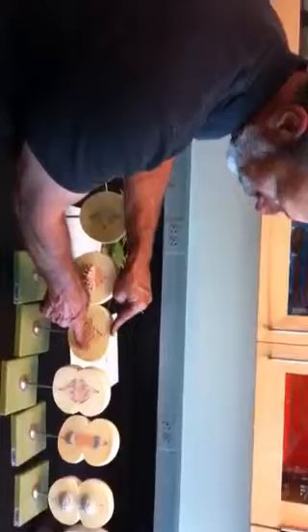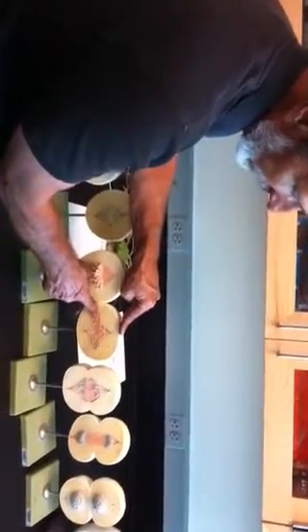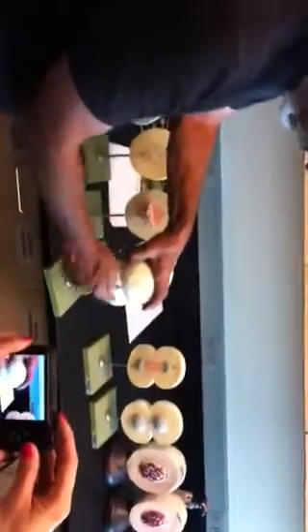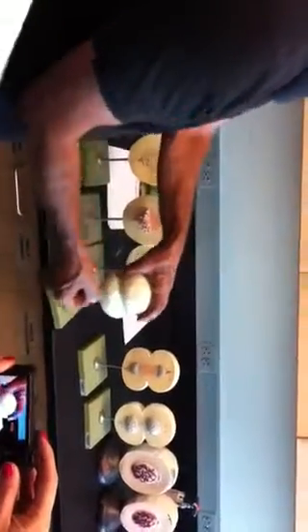Now you can see the kinetochore microtubules pulling the chromatids apart. This would be early anaphase. This would be a later anaphase. Notice that there's a furrow cleavage here. Where I found this was actually right there. So what I was asking the class is, what is this structure? That structure is a furrow cleavage.